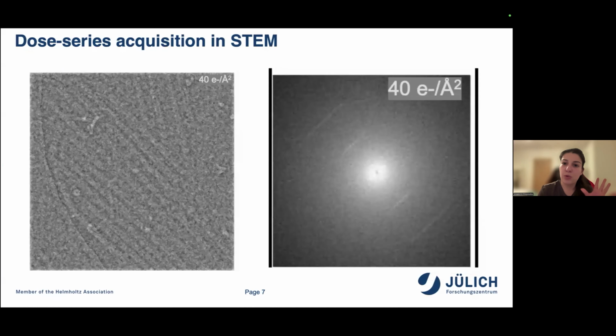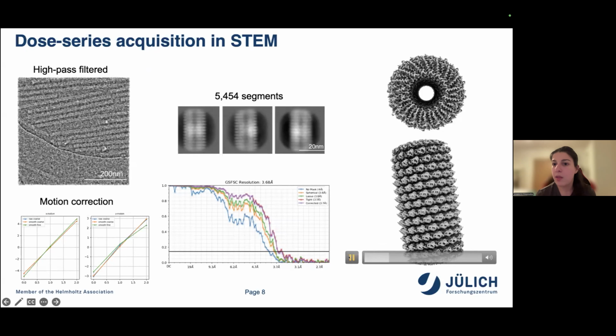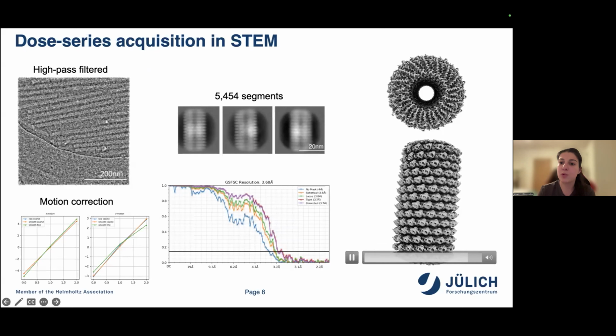Although I still wanted to perform some 3D reconstructions, and as I had the movies, I high-pass filtered them. You can see that the contrast is really better than in the single micrographs. Then I performed motion correction, and at the end, approximately 5,000 particles have been selected. And that led to a final resolution of 3.7 angstrom. The map looks good. You can see the alpha helices and some good details.